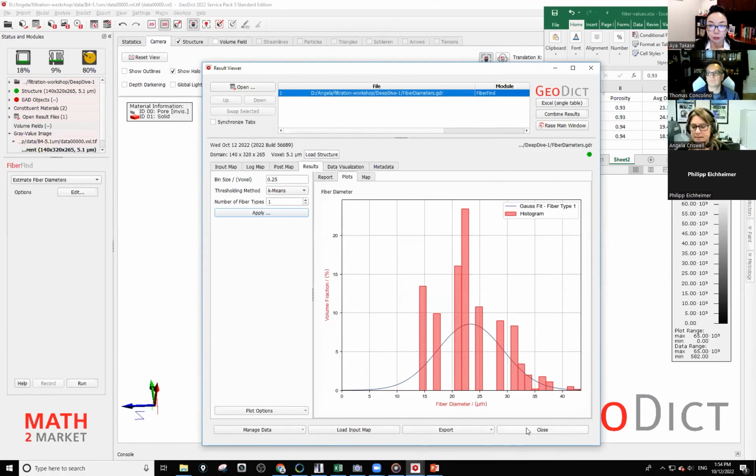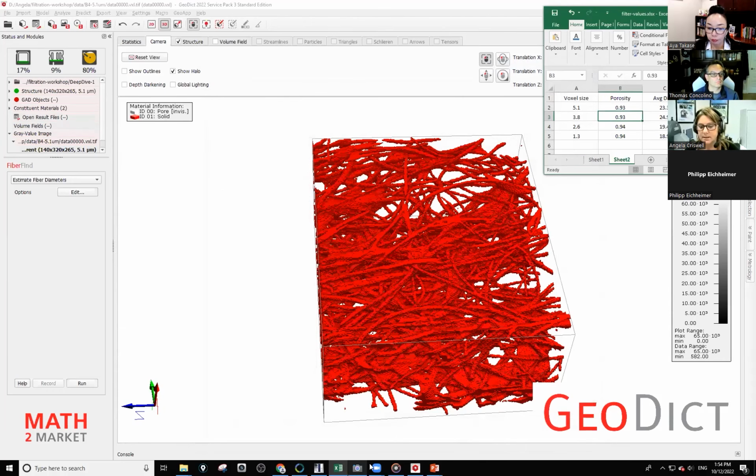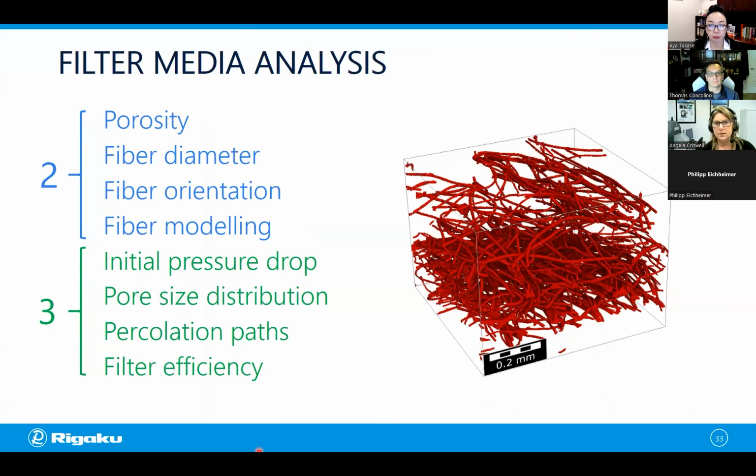That pretty much sums up what you would do. We would recollect in a different beam mode or a different exposure time, for example, and look at a table and compare all of these to see if we're happy with the results to do further analysis. All right, with that, I think it's time to go back to our presentation here. Hopefully you see the slide again. Okay.